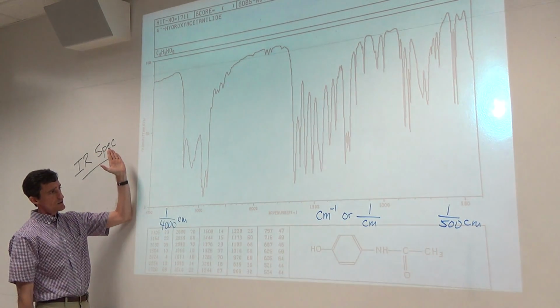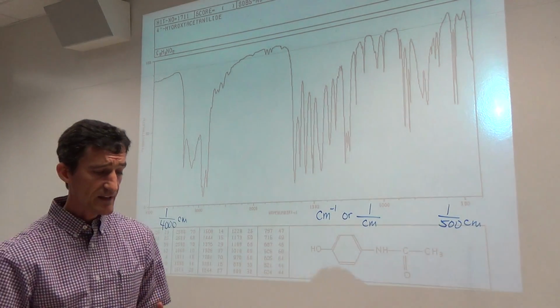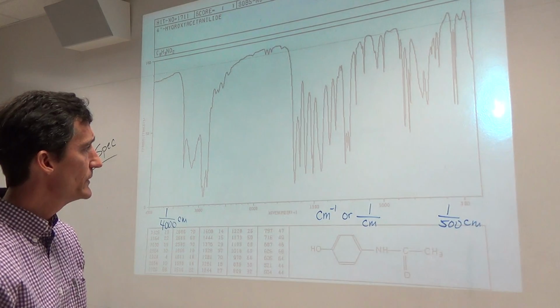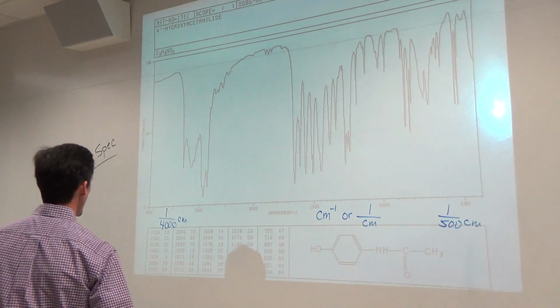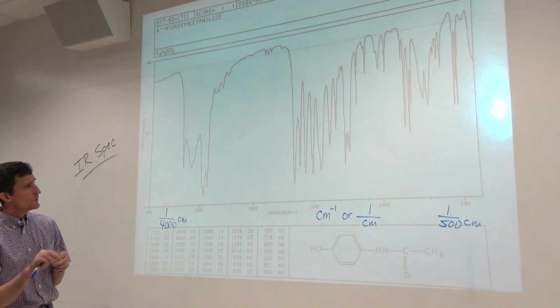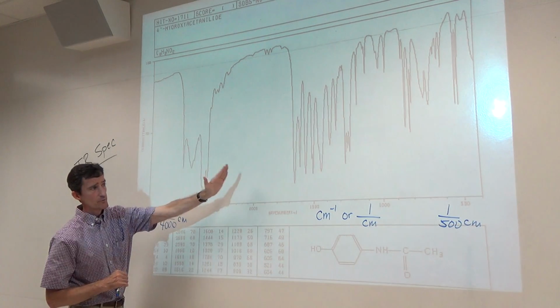What we do is, first we expose our compound to IR. Today that's a very simple technique. We can take a look at instruments at some point. You'll be doing that in lab. It's very simple these days to put your compound on the IR. Once you hit start, from there it's quite simple. The instrument will scan the IR range.